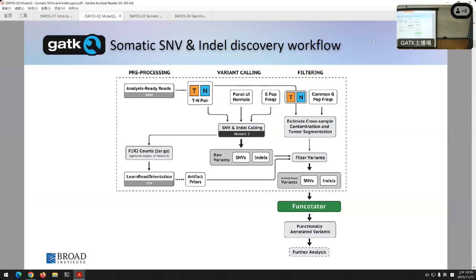We have a separate one called allelic CNV, a specific tool for detecting that case. It might sound like this one is good for that, but if those are the events you're looking for, this won't be the best tool for you. To move on, I'll go into more details on what the arguments are and why we use them in the variant calling section.